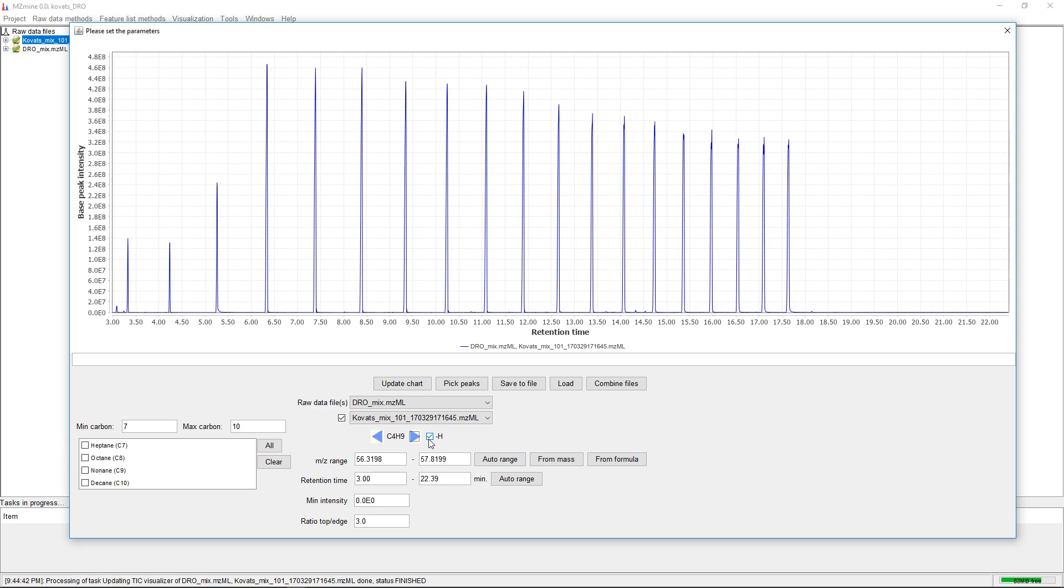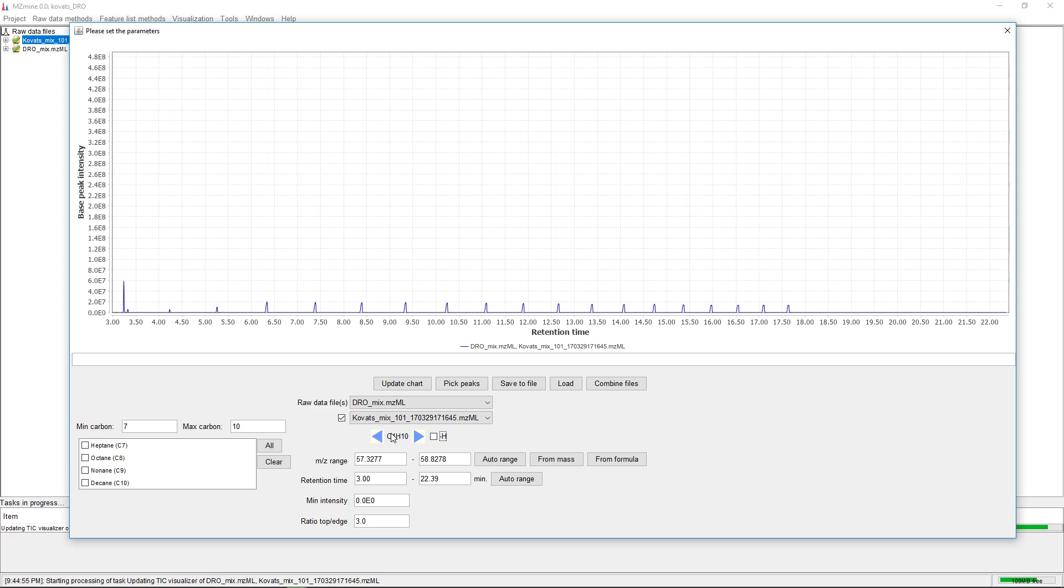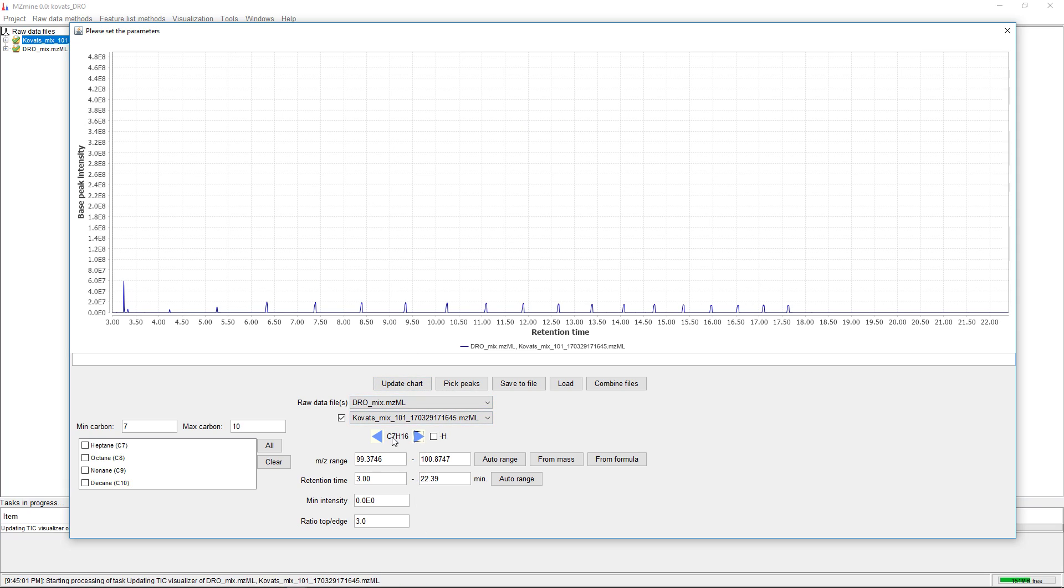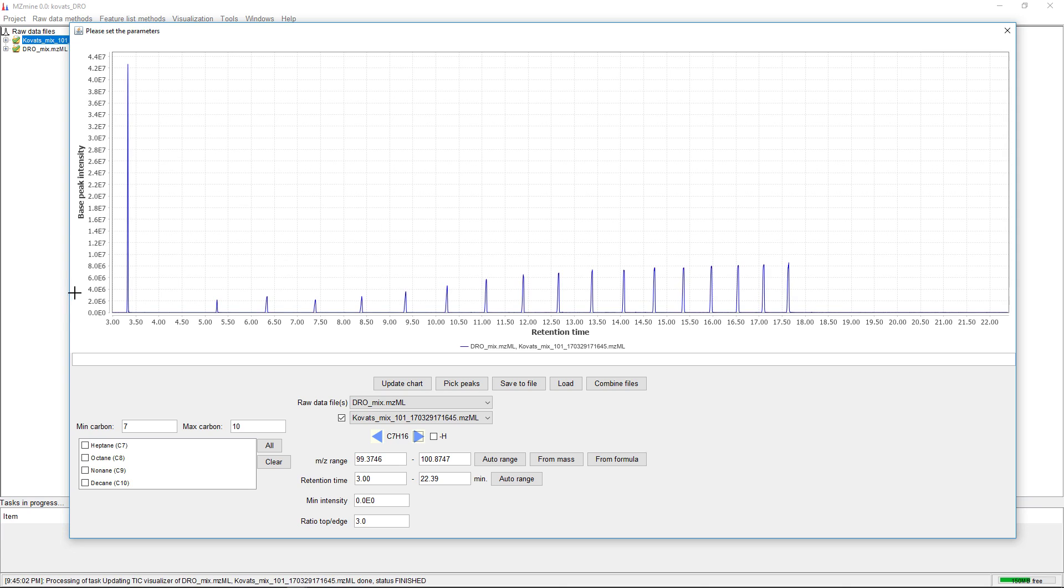We have the option to subtract one hydrogen or use the alkane as is. If we go to C7, for example, we can see that we have C7 here. Heptane elutes very early.